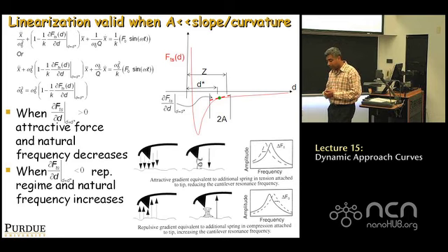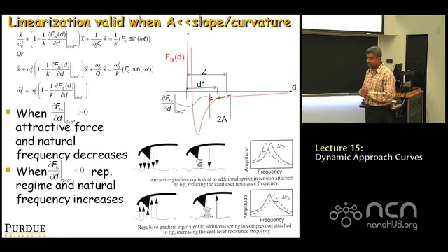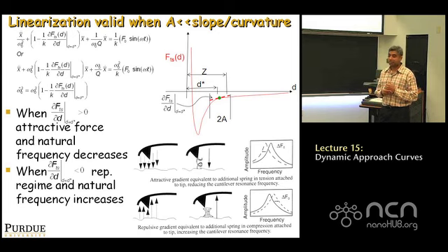So the bottom line of this linearized analysis that we discussed last time was that if your oscillation amplitudes are really, really small, the interaction force can be just thought of as a spring, because the only effect it has on the cantilever is in shifting the frequency. So it's a spring, effectively. That's what is shown here.